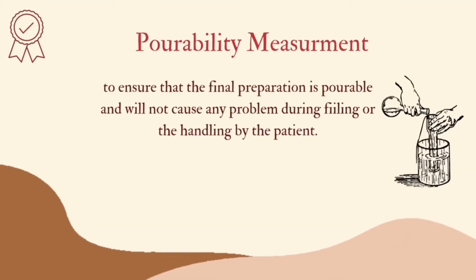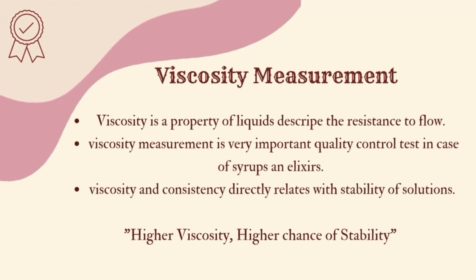Pourability measurement is used to ensure the pourability of the final products, so that it doesn't cause any problem during the filling or the handling by the patient. Viscosity measurement. Viscosity is a property of liquid that's directly related to resistance to flow. Viscosity measurement is a very important quality control test in the case of syrups and elixirs. Viscosity directly relates with stability of solution. The higher the viscosity, the greater the stability.